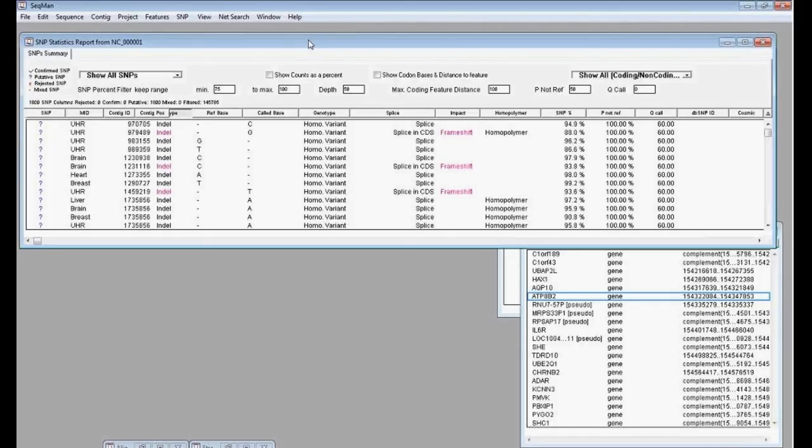Great. And then a final question here. In this particular example, you've aligned to a single chromosome. A question came in: is there any difference in quality or perhaps bias of the aligner if you use a single chromosome versus using the entire genome?